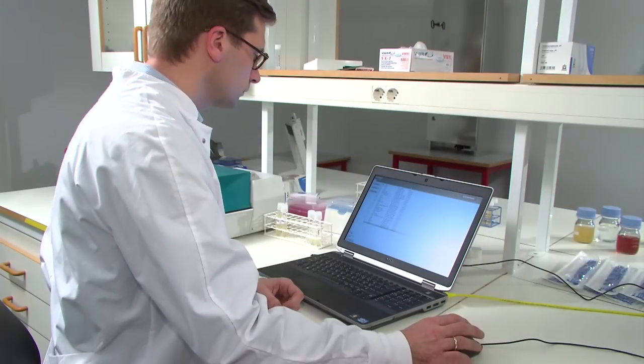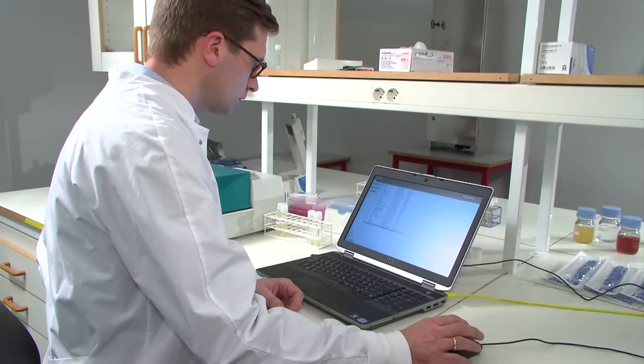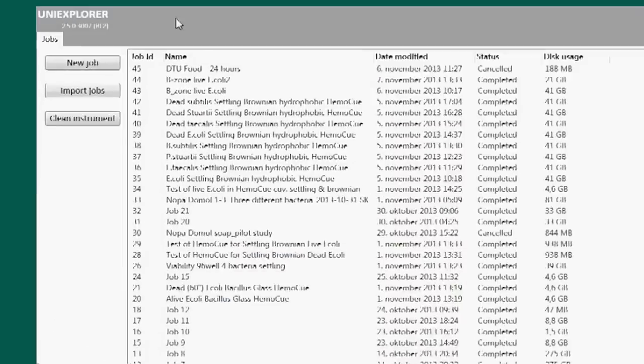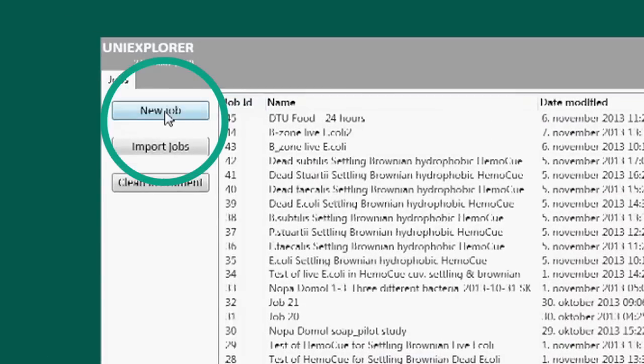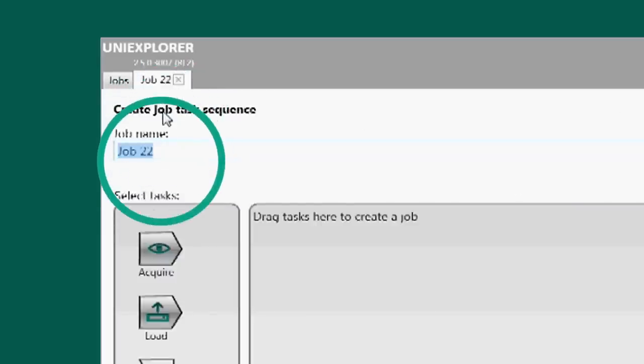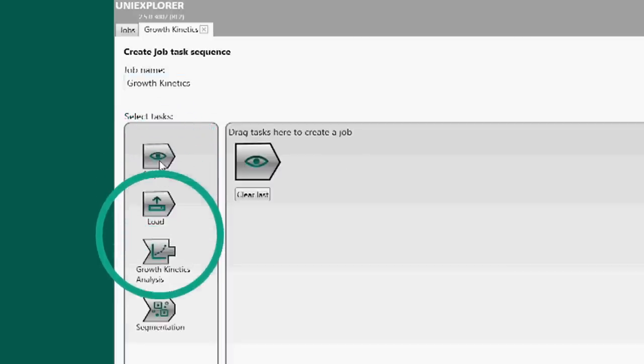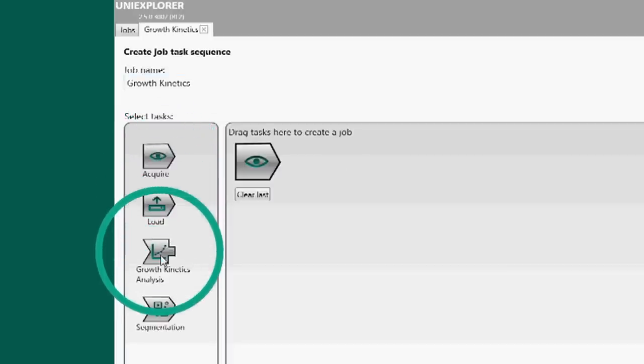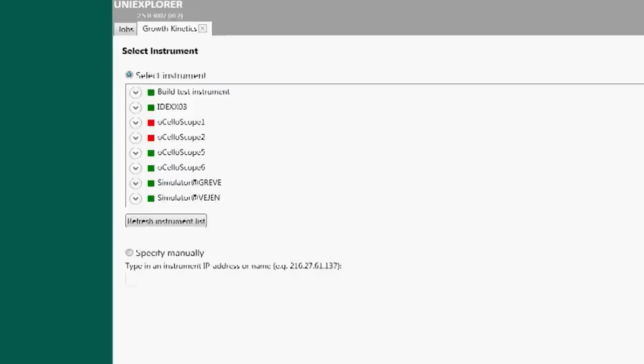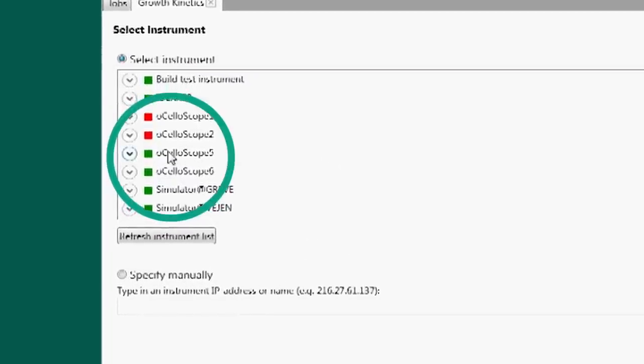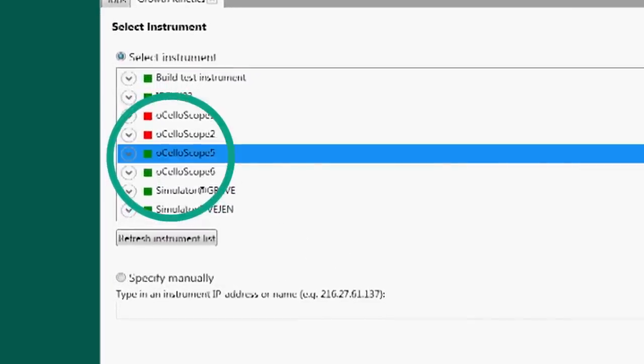The UniExplorer program on the computer is then started and New Job chosen. The sample is given a name, then choose the Acquire module and after that the Growth Kinetics module. If more than one Ocelloscope is present on the network, the relevant instrument is chosen from the list.